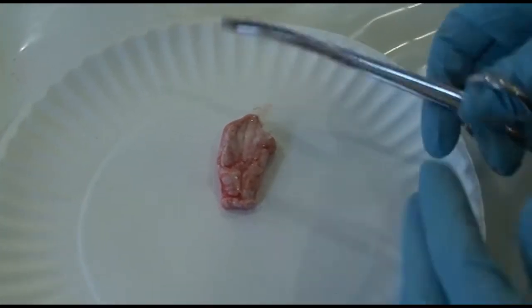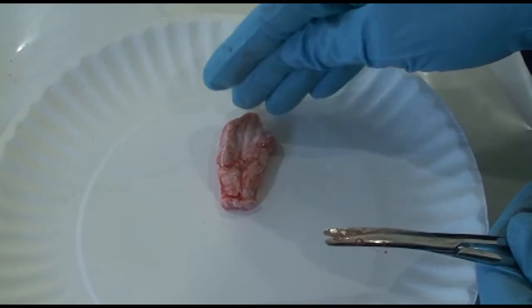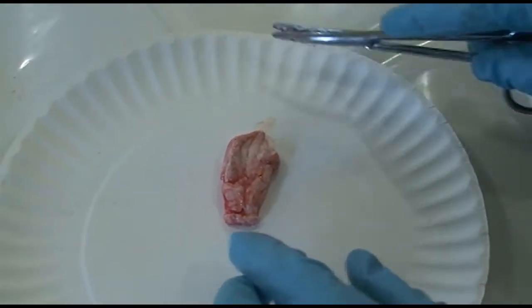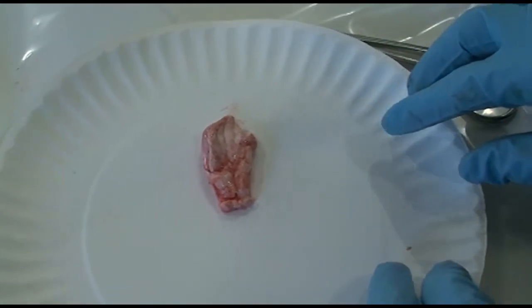But if you have a lot of extra, if you pull some of the cerebrum with it, you might want to cut that off, but if you get this much, that all goes in your formalin jar.